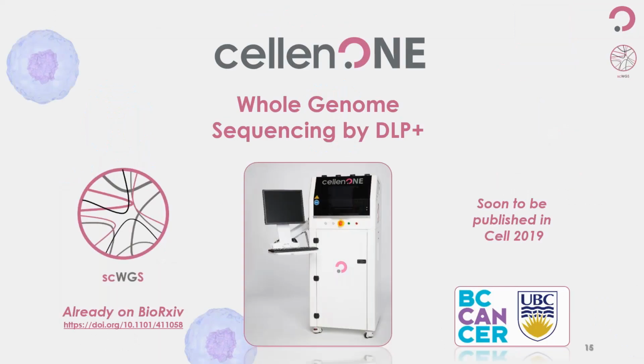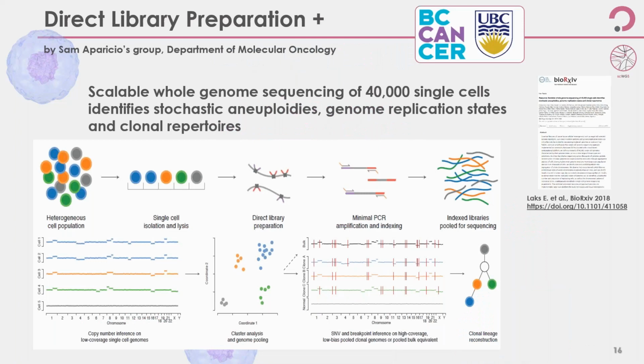This is some very nice work done at the University of British Columbia in Vancouver and the British Columbia Cancer Research Center by the group of Sam Aparicio and Robin Koop. They recently published a very nice article on bioRxiv, and this article actually has been just accepted in Cell and will soon be published in that very nice journal. And the method they've developed is for whole genome sequencing, and it is called Direct Library Preparation Plus. Some short words about this method.